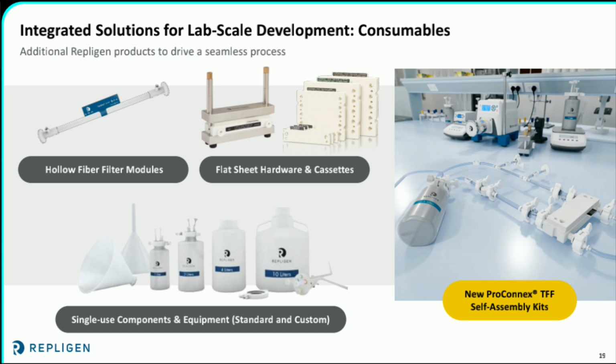On the bottom, you can see single-use components and equipment. So we've got an entire fluid management division that is dedicated to providing any solutions that you need. So here you can see things like bottles, dip tubes, funnels, etc. But basically any potential fluid management need you would have, definitely reach out to us.